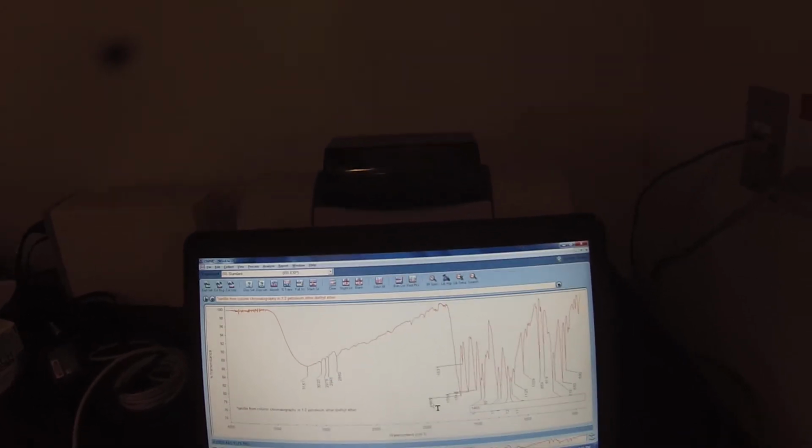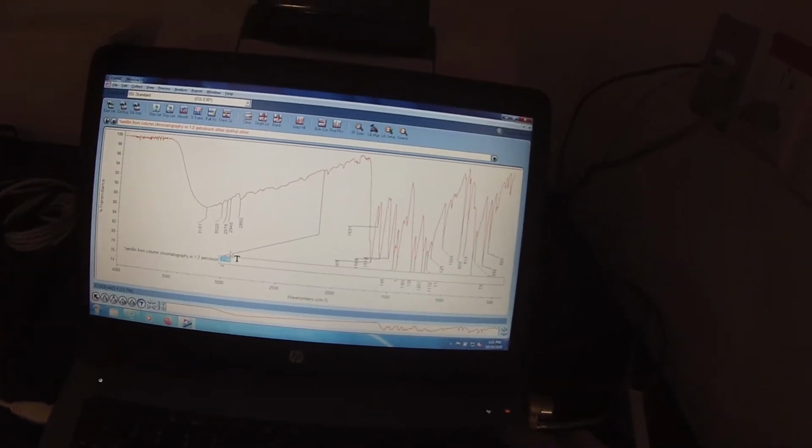Okay, peaks. Alright, it's being difficult. I'm going to get back out of there. We have a glitchy software. There we go.